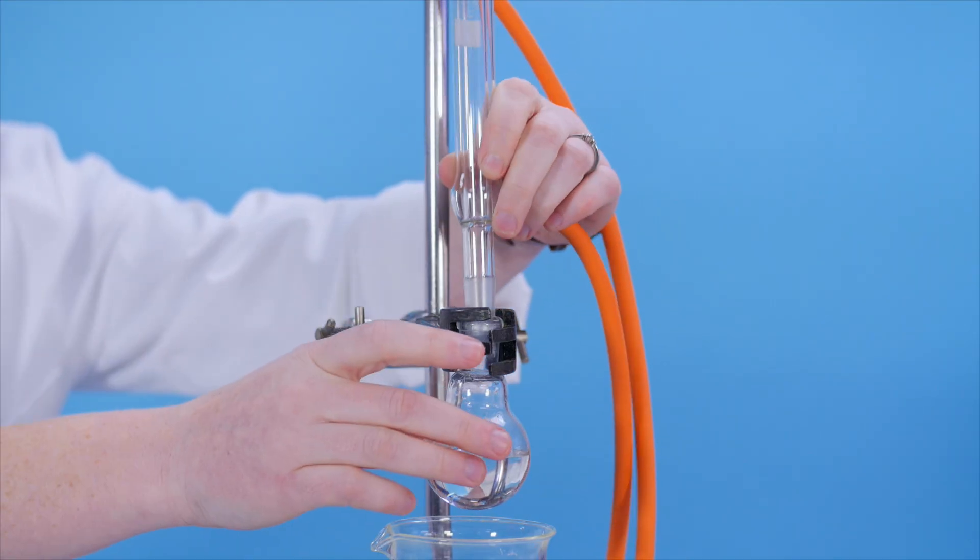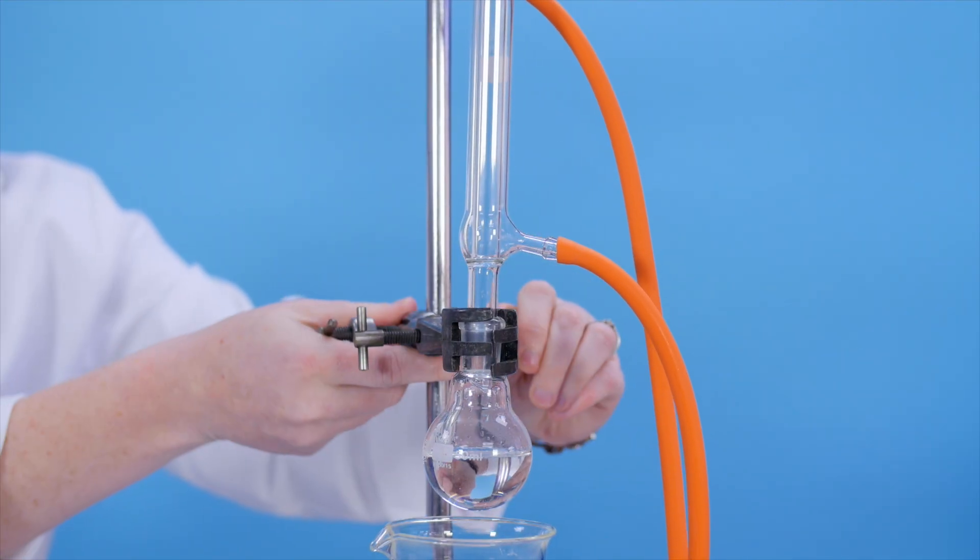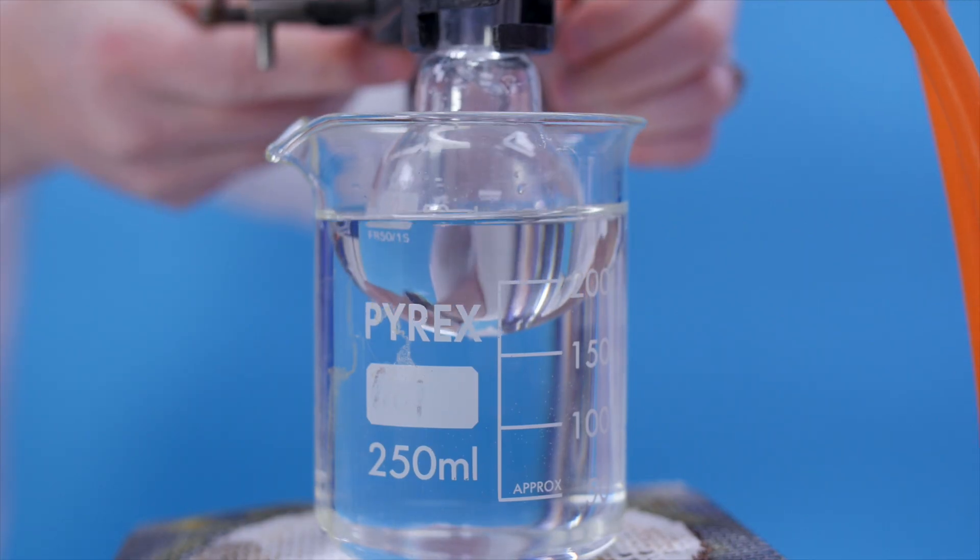Fit a condenser to stop any vapours escaping. Then heat the mixture in the flask to 70 degrees Celsius in a water bath.